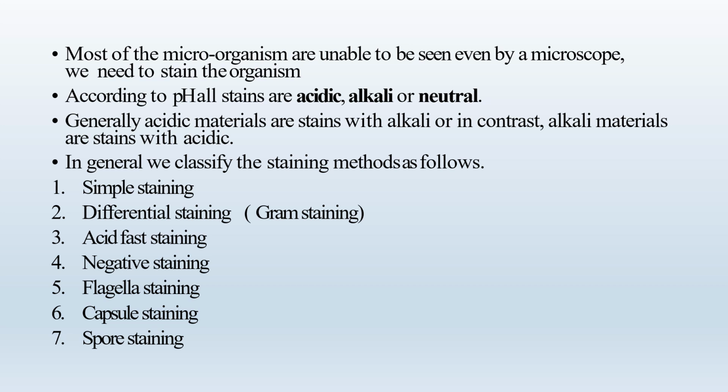We classify the staining methods into the following categories: simple staining, differential staining, example is gram staining, acid-fast staining, negative staining, flagella staining, capsule staining, and spore staining.